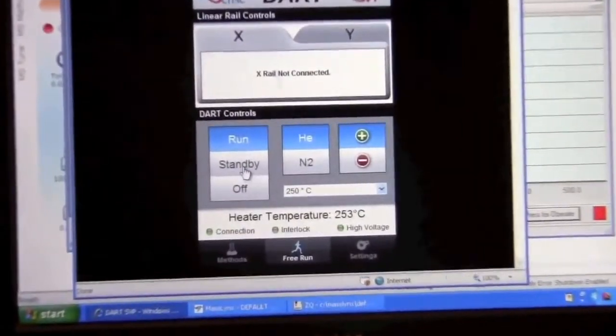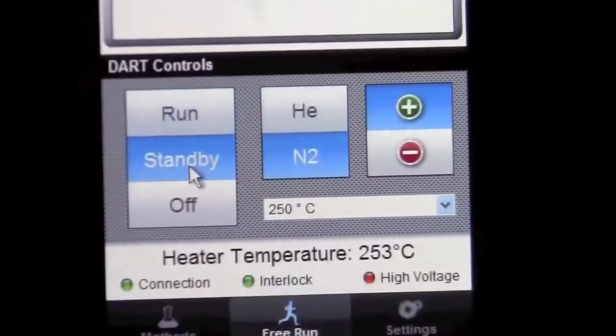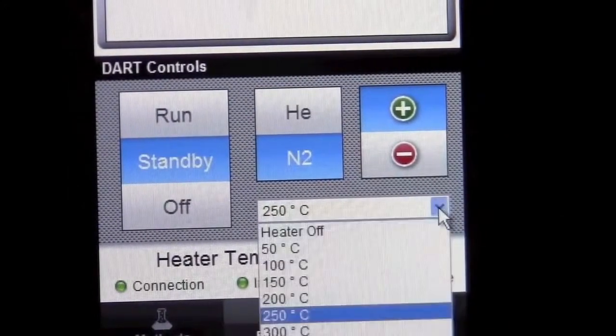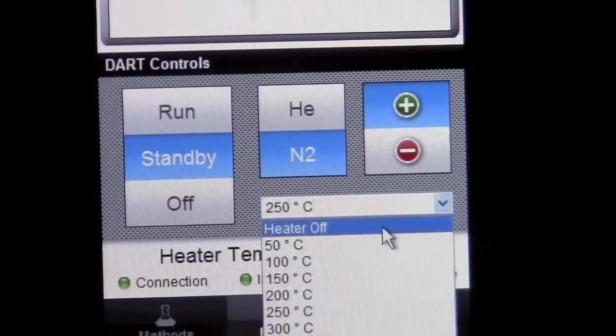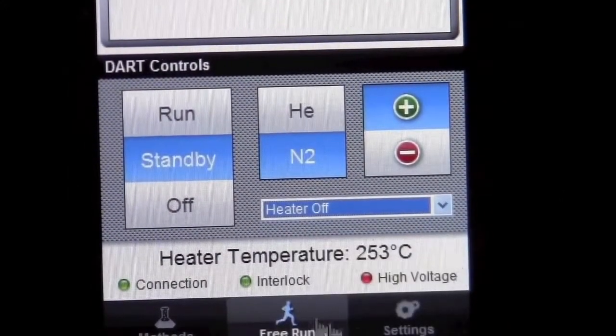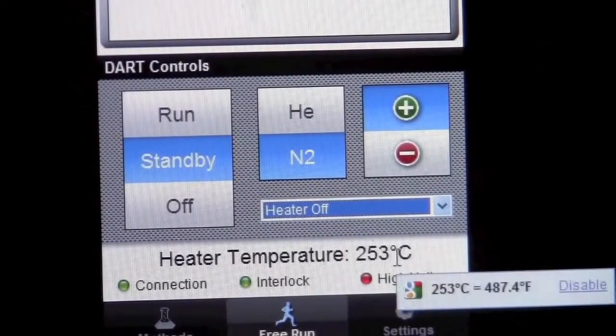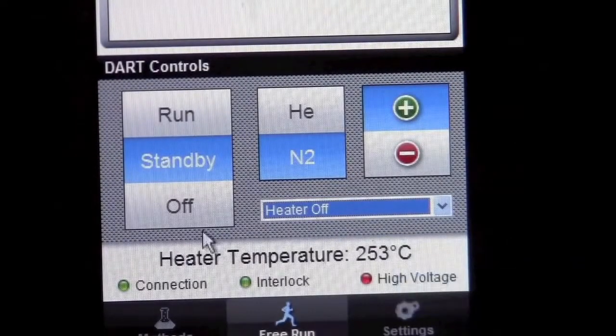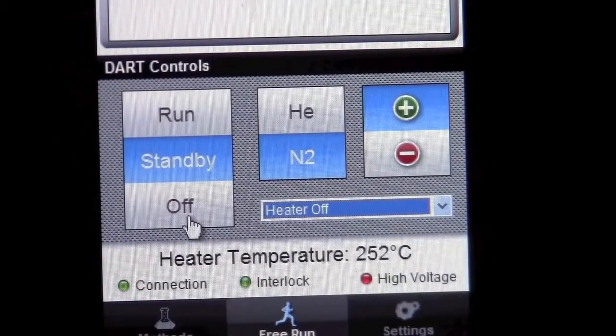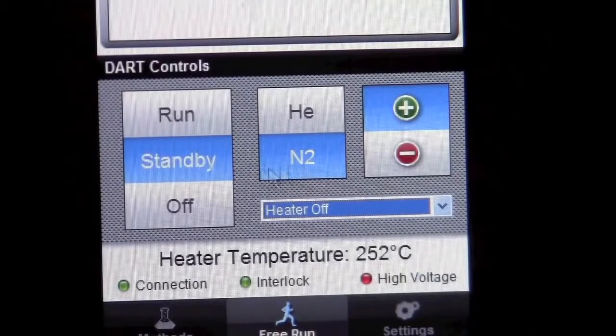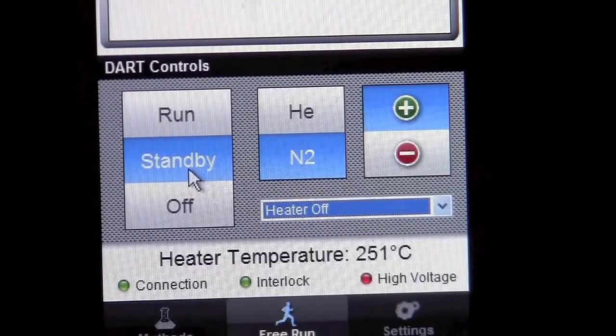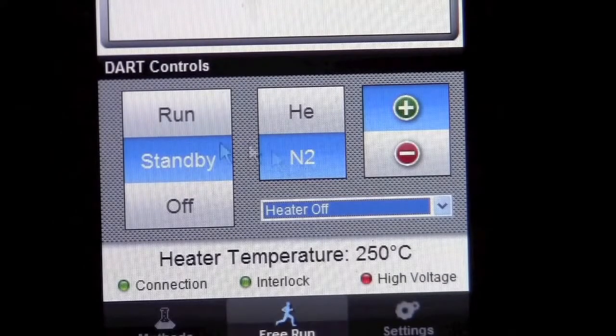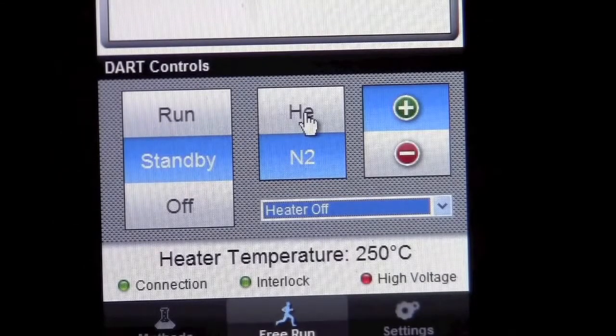You can put it on standby and turn the heater off. After the heater temperature has cooled down to room temperature, you can set it to off. That will help us conserve nitrogen. But please remember to at least put it in standby so we don't waste helium.